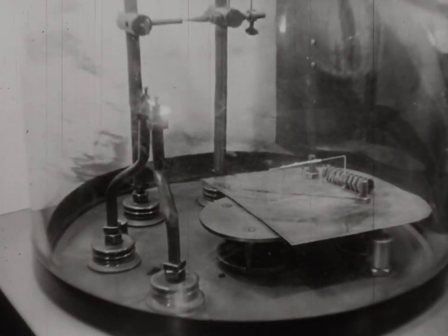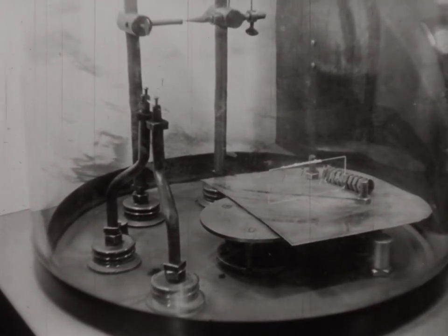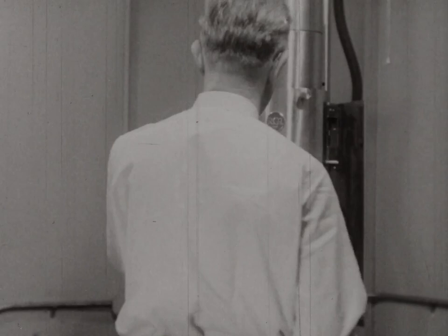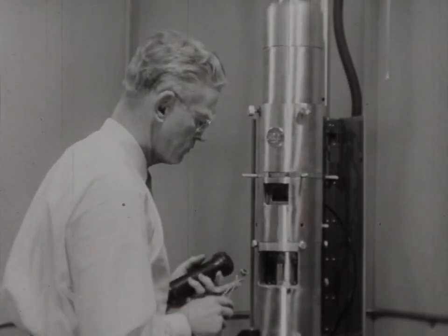Now, if we go back to the filament and turn it off, then we're ready to take the specimens out. We can then put them in a little holder and insert this holder in the electron microscope.